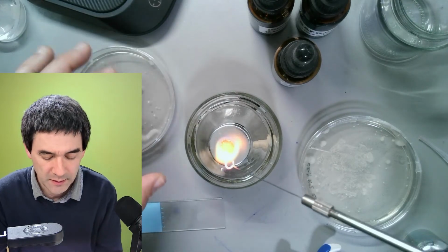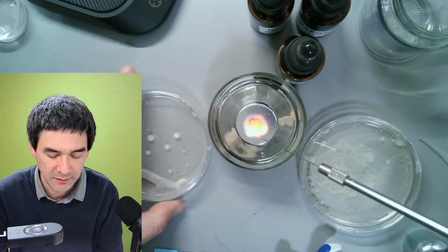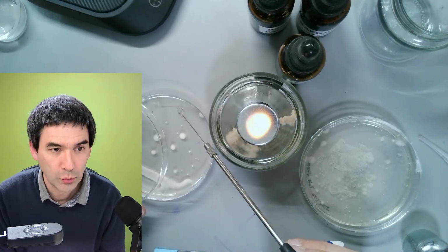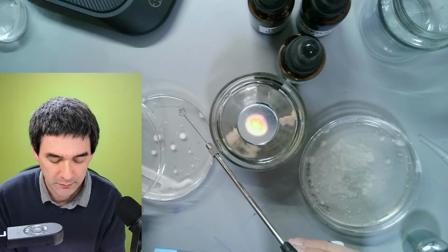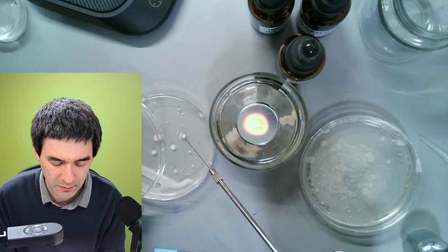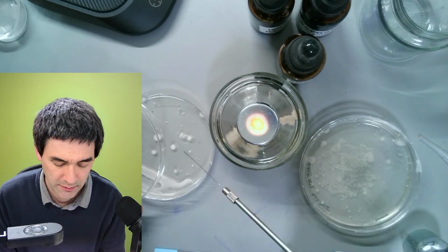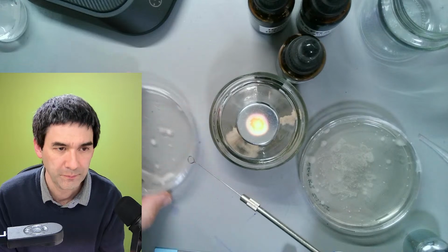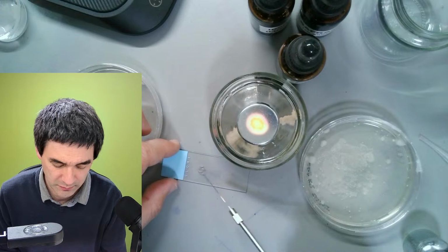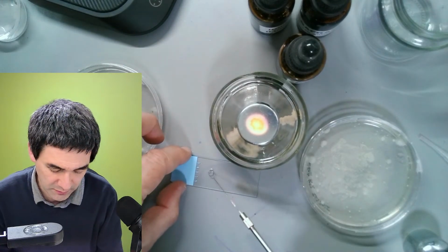Now I'm going to take this here, open it, and cool the wire. It makes a little sound. I'm going to grab a little bit of this colony over here. There's not very much on here. I'm going to try to suspend it now in here, and I'm just holding it. Yeah, there is something in here, not a lot.